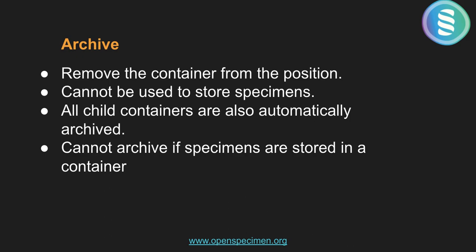Archiving removes the container from the position. It empties the position so that new containers can be added at that position. You cannot store specimens in an archived container. All the child containers are also automatically archived.